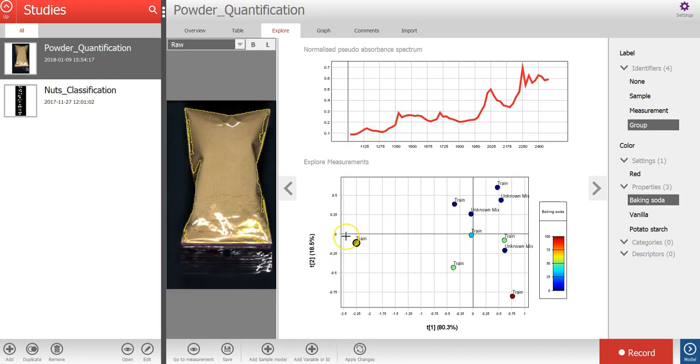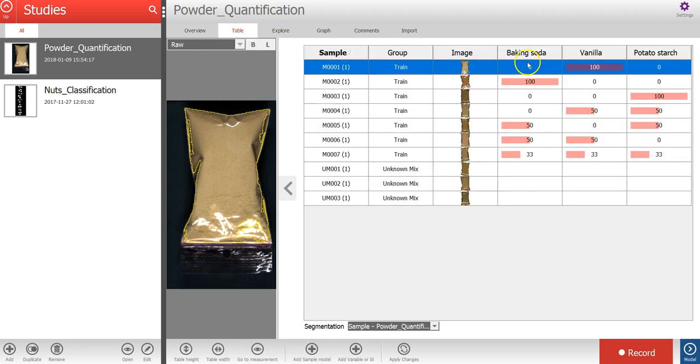In the menu on the right, I can select the average spectrum for each sample and the property values, which is the percentage of the three powders to train a quantification model.